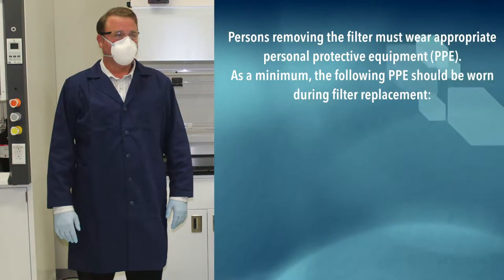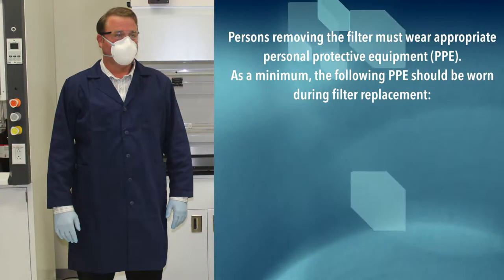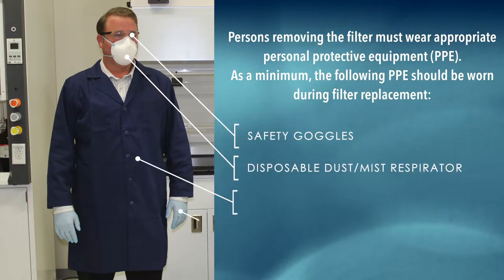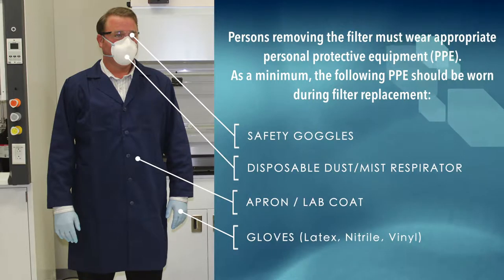Persons removing the filter must wear appropriate personal protective equipment. As a minimum, the following PPE should be worn during filter replacement: safety goggles, disposable dust/mist respirator, apron or lab coat, and gloves.